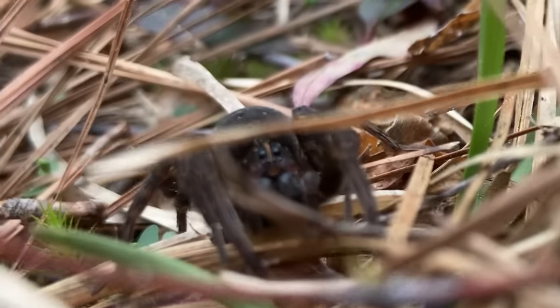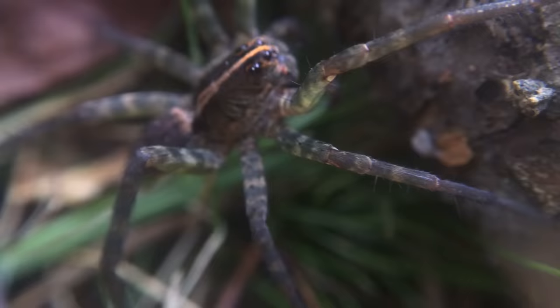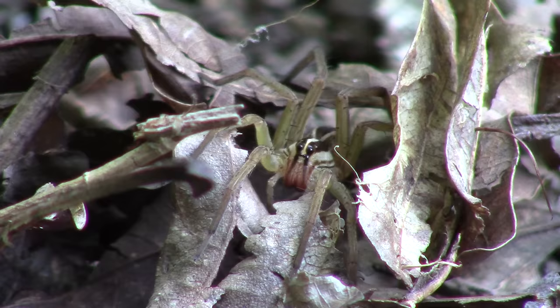Today we're gonna simulate what happens when a wolf spider bites you. I'm gonna be adding wolf spider venom to human blood. Okay, so why are we doing this? Well, if you've ever seen a wolf spider, it's no surprise why people are afraid of them. With fangs like those, a bite from a wolf spider is definitely gonna be unpleasant. What I wanted to test was how potent is that bite? And also I kinda just wanna see venom react with blood under a microscope.